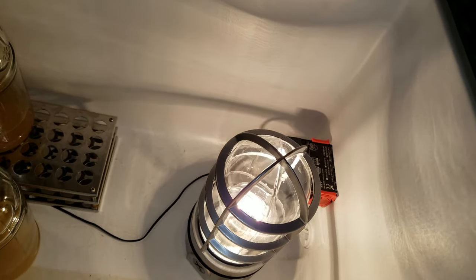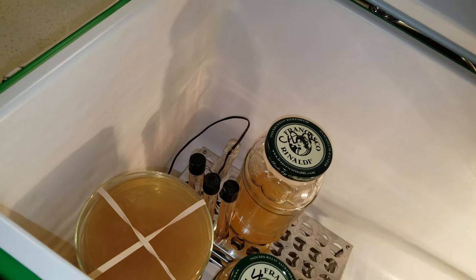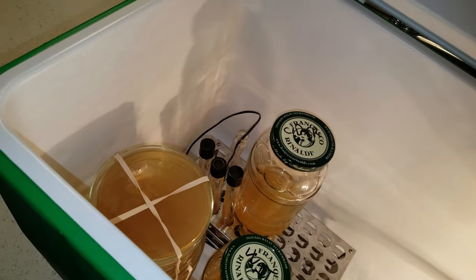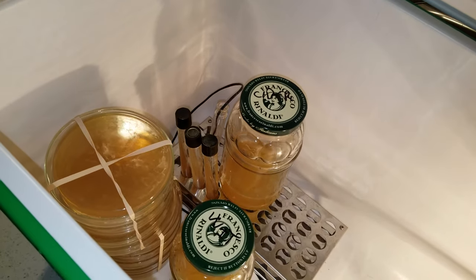The temperature probe goes from the controller into a test tube that I have sitting over here with just water in it. That way you don't have great fluctuations in the temperature. Next to the test tube that has the probe in it, you can see the test tubes — the slants from the previous videos.